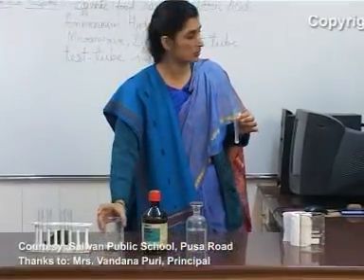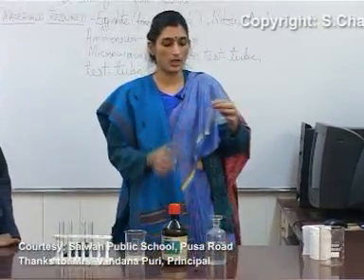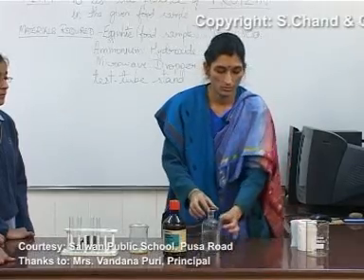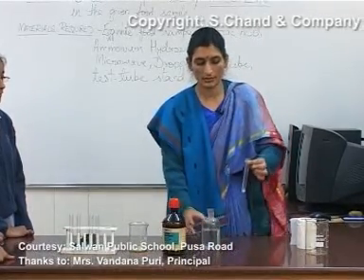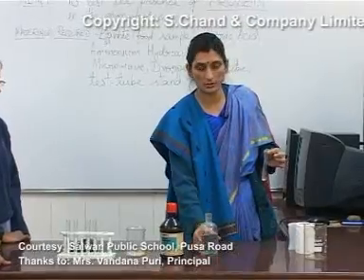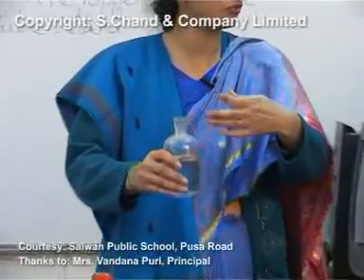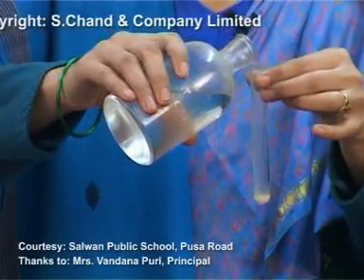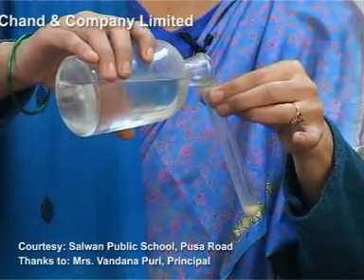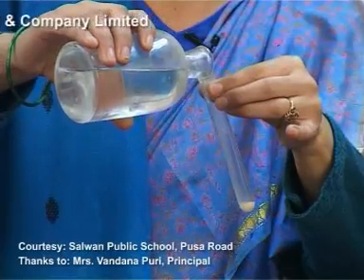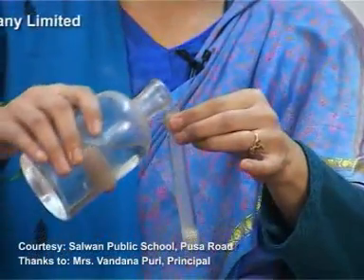Then we use its solution as the food sample. After adding the food sample, we add nitric acid. Nitric acid has to be handled with care — you can see the fumes coming up. Carefully pour in around one ml; if you want, you can use the dropper. Add the same quantity of nitric acid.